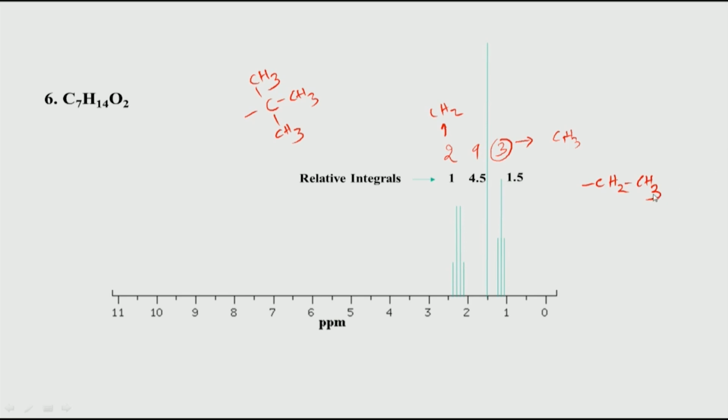And similarly this CH3, when it is coupled to a CH2 with 2 protons, you expect to get a triplet, and that is this peak. So, whenever you see a triplet and a quartet, you typically expect that to be this particular system. And because this is coming in the zone between 0 to 2.5, it is not directly attached; there is no direct oxygen here.